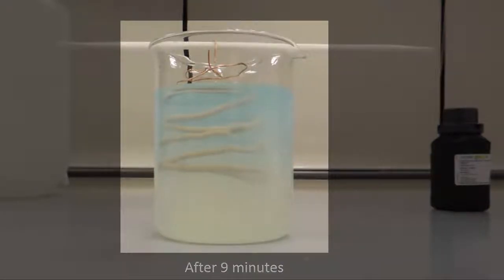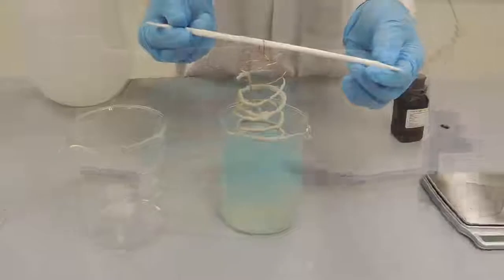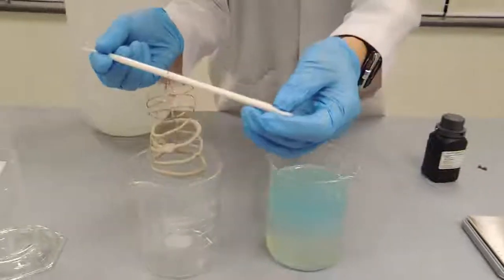After approximately 10 minutes, small and spiky silver crystals were observed forming on the copper wire. In addition, the solution has turned blue in color due to the Cu2+ ions.